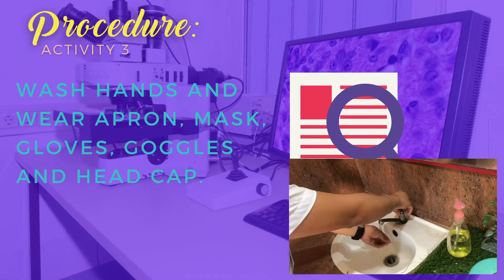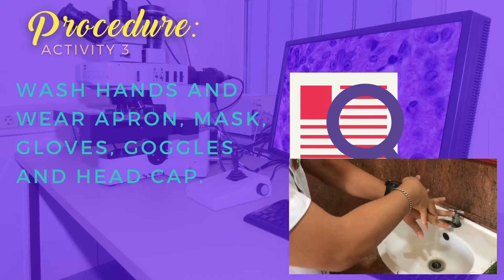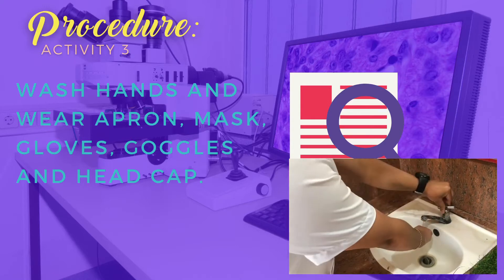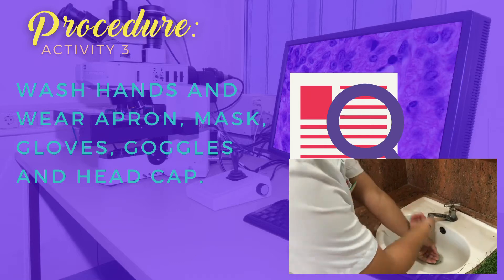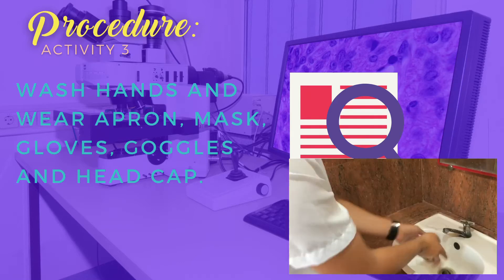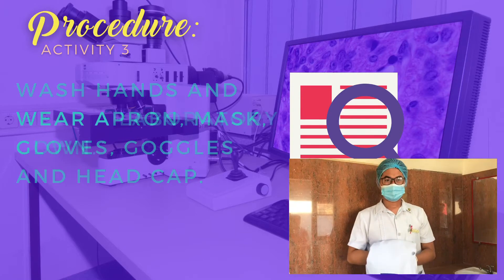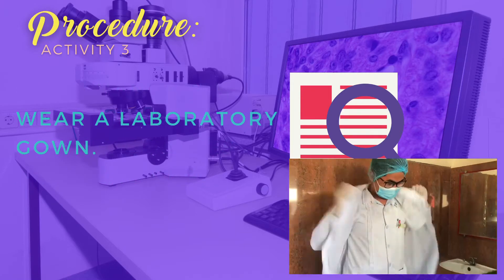Procedure 1: Wash hands and wear apron, mask, gloves, goggles, and head cap. Don't forget to wear your laboratory gown.